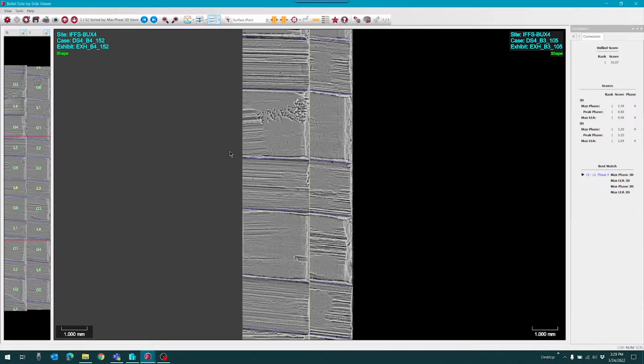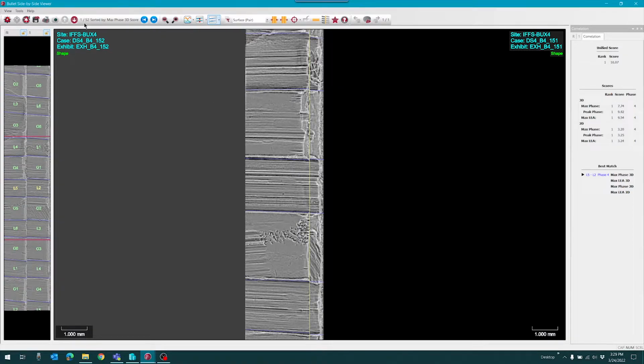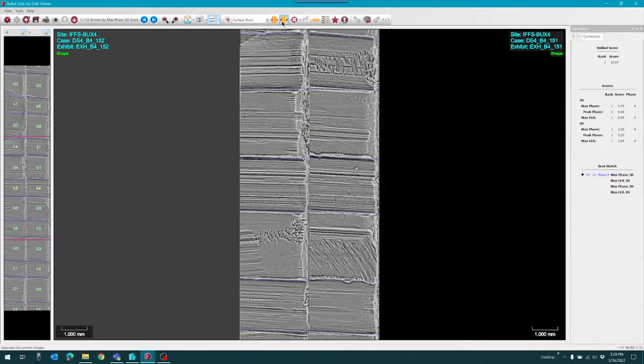I can just tap up, and I'm going back to 1 of 52, and I've got 1 comparison to do in that one. When I look at this one, and actually I want to see, let's separate these, because when I do my screening, I want to see all of the reference, all of the test. And now, at this point, I will just have my hand on the arrow keys, and I only have 1 best match to look at with that blue text over here. And so if I see something, I'll do a comparison.